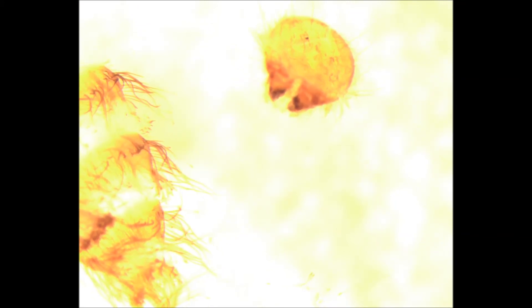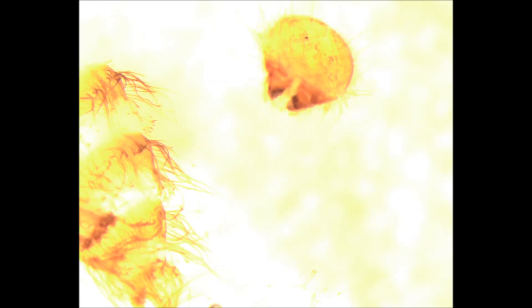Let me show you the tip of that. It's got a two millimeter blade like that. I'll use that to cut the head just behind the mandibles, which will help me get the mandibles out of the way and work on flattening the epipharynx for viewing under the compound scope.